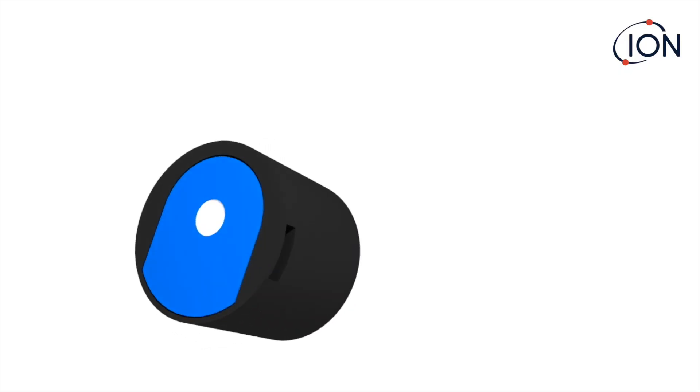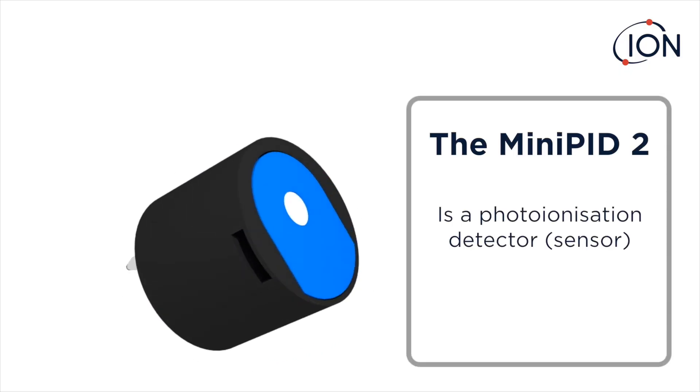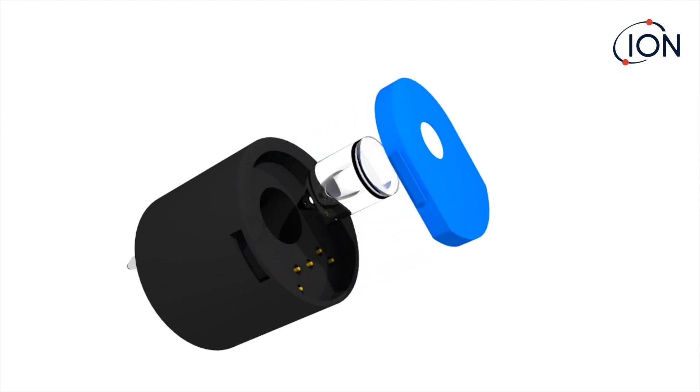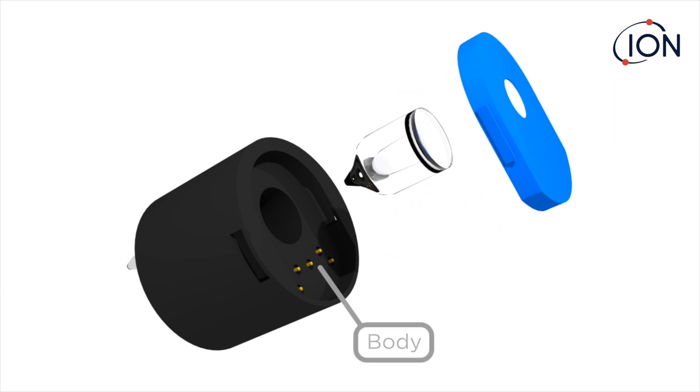The IonScience Mini PID is a photoionisation detector that detects a wide range of VOC gases. It consists of three main components: the body, the UV lamp, and the electrode stack.